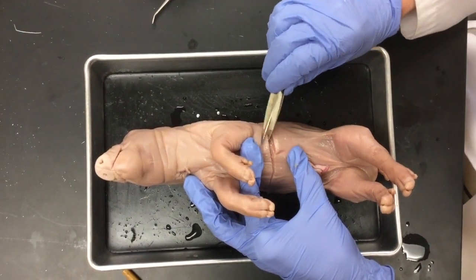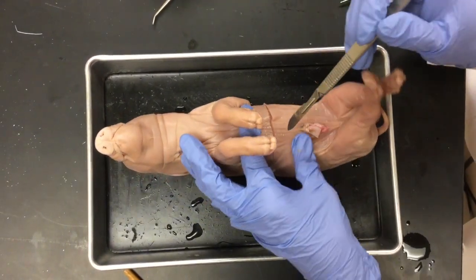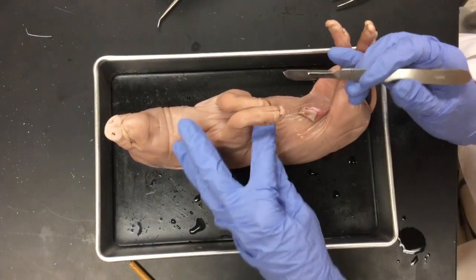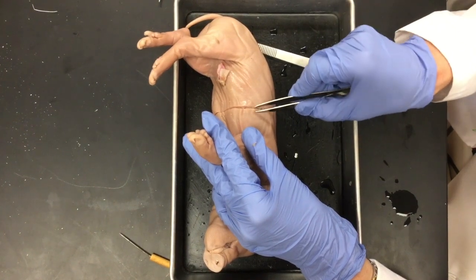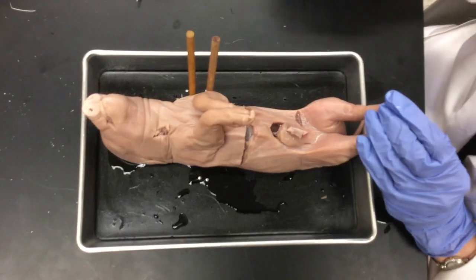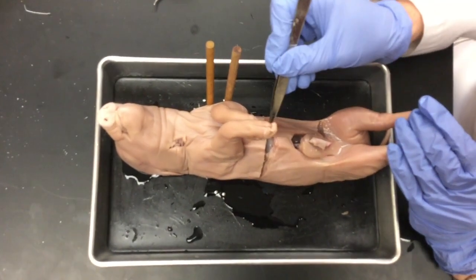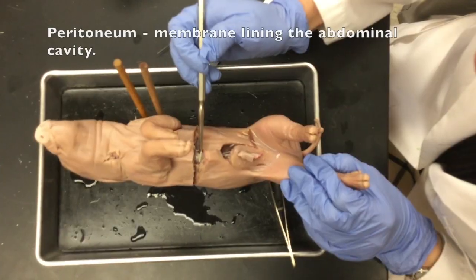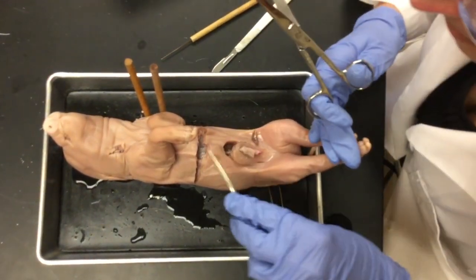I still see a film there and I'm trying not to cut it. What you can see is the peritoneum, which is a film that actually separates the skin from the abdominal cavity. Place the pig in the tray and orient it any way you like. As you cut through skin and muscle, you will come across the peritoneum — the lining that covers all of the organs in the abdominal cavity. I purposefully did not cut all the way through this film.